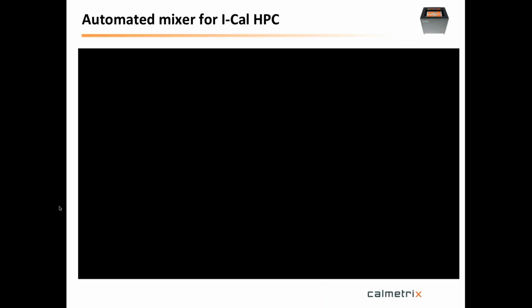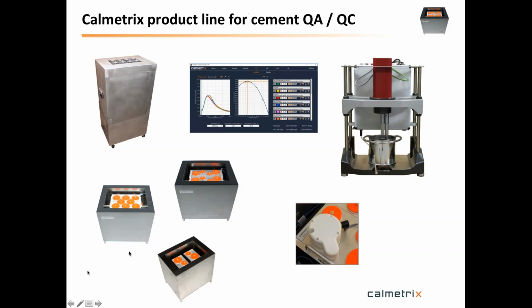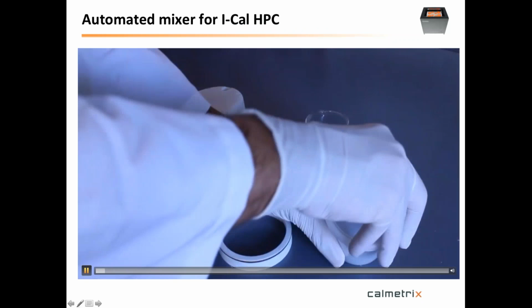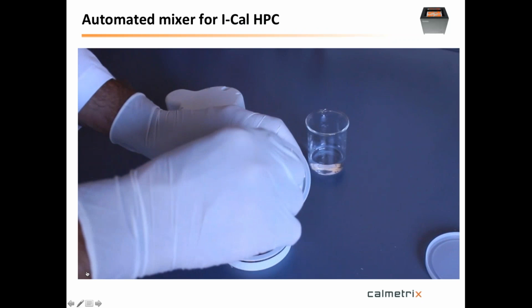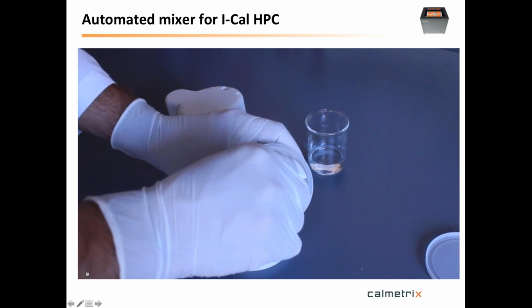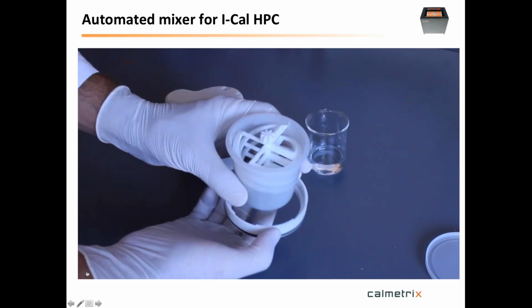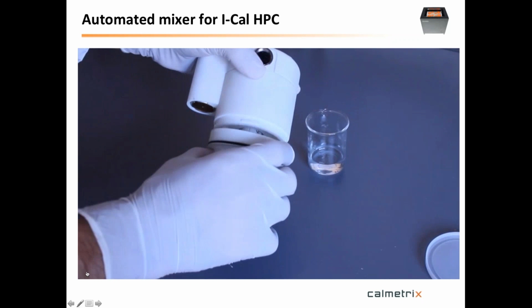And I also have a short video that shows how easy it is to assemble those when you prepare your sample. Here you go. So you have those different parts. This is the cement in the vial, and you put the impeller in with a rotation movement, because otherwise it will not penetrate into the cement powder. Then you assemble the motor on top.